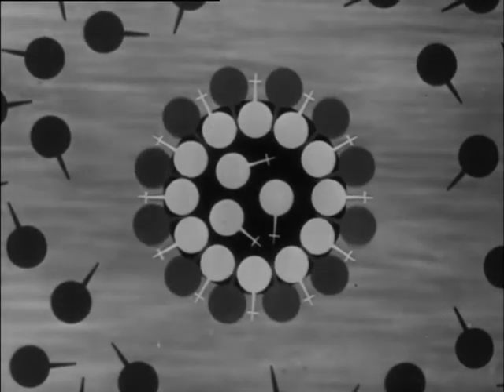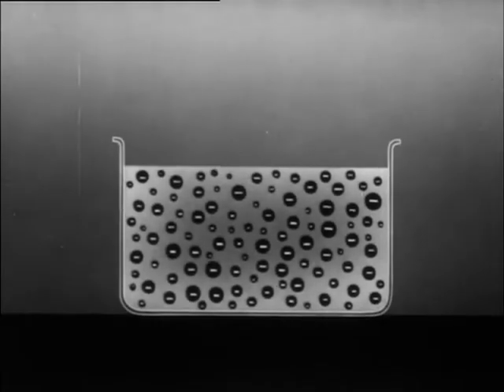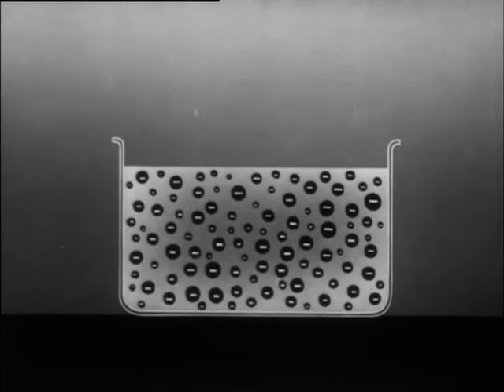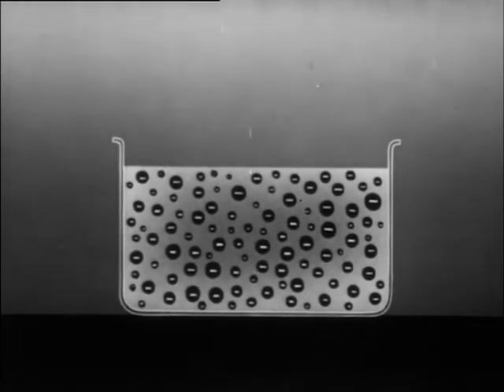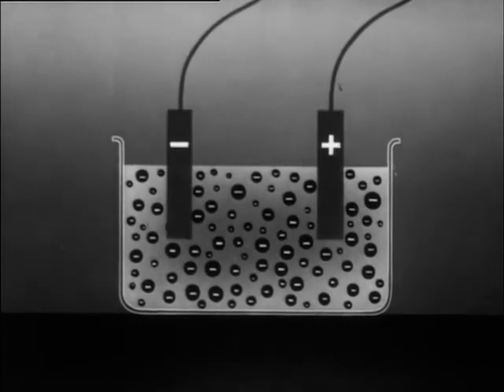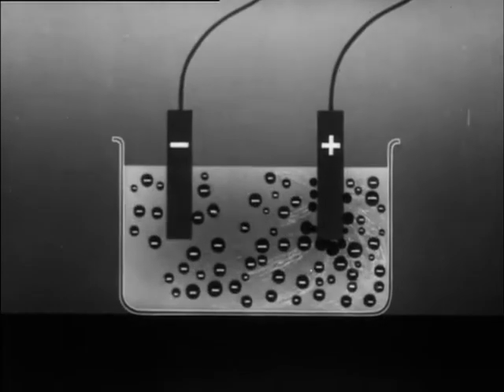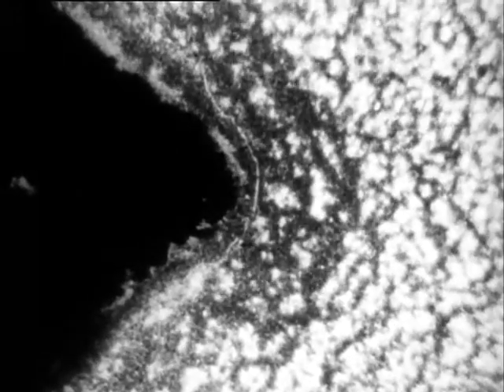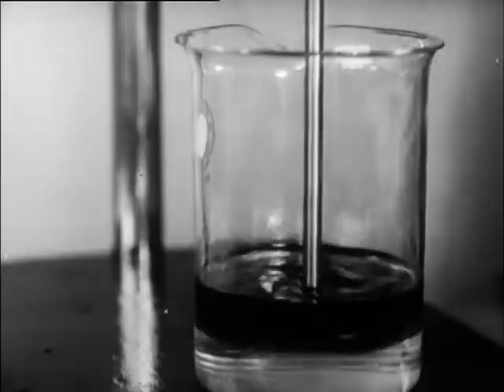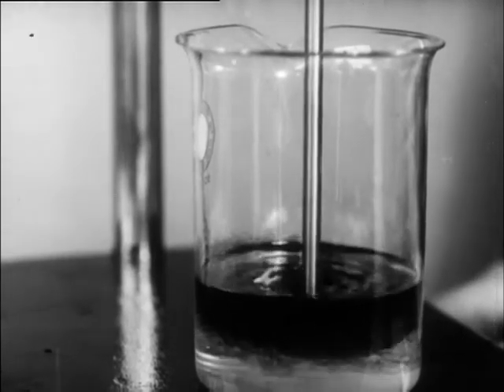Another thing which keeps the globules from coalescing is the fact that they are electrically charged and thus tend to repel one another. The charge arises from absorption of ions and from the fact that the emulsifying agent itself may be ionized. That the globules are indeed charged can be shown by passing a current through an emulsion, when the globules move towards the electrodes and the emulsion breaks down. This is demonstrated microscopically when the triangular pole on the left is positively charged by connecting to a battery.